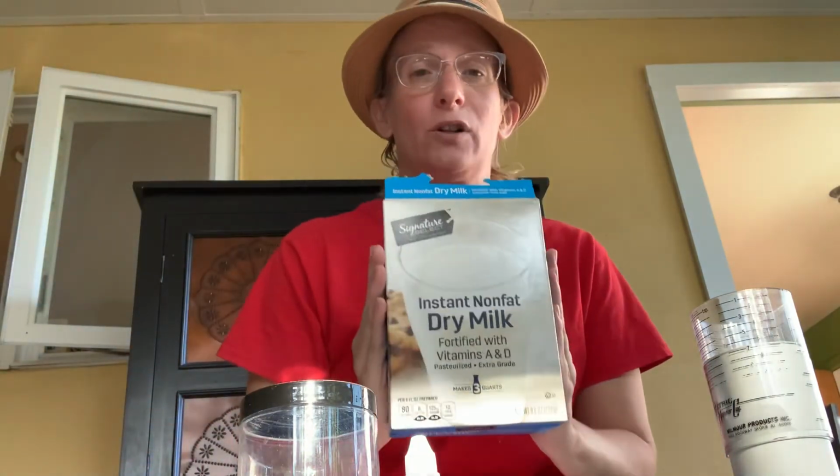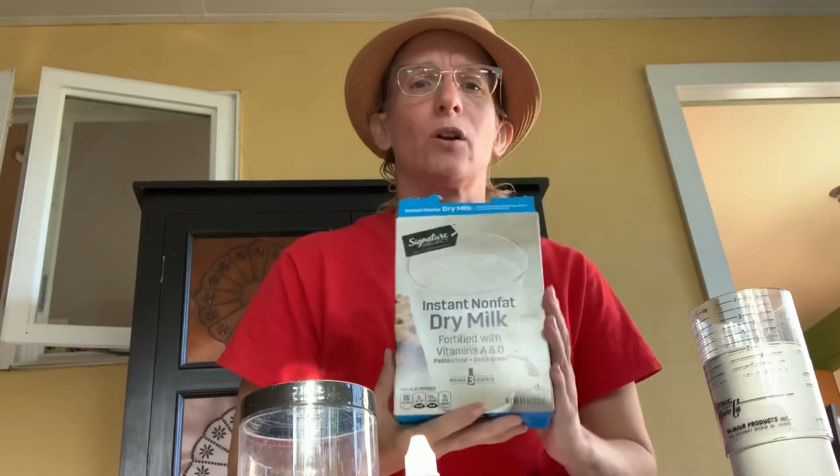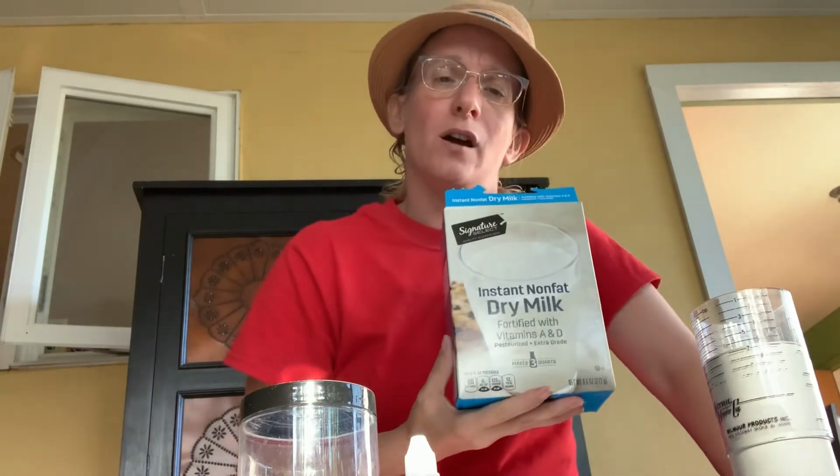Another nice thing about it is that you can do it using stuff that you just get from your grocery store, or you might already have lying around the house. So what you are going to need is some powdered milk. I'm told that you can also use fresh milk for this, but I don't know what the proportions actually are, so I'm going with the powdered milk recipe. I found you can't actually get powdered milk at Whole Foods.